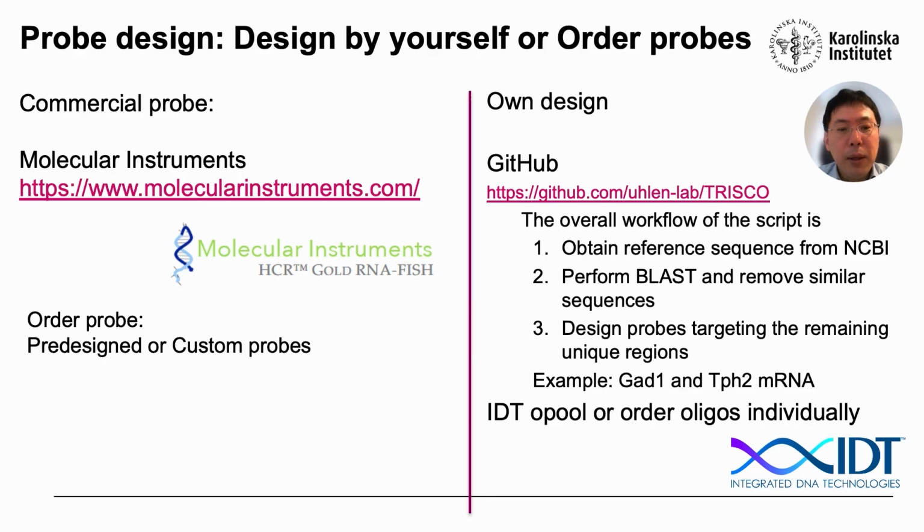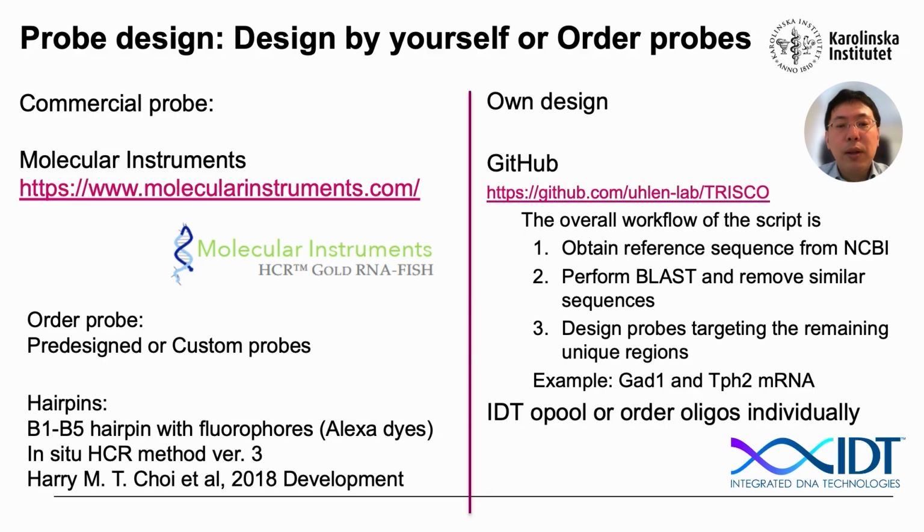Regarding the hairpin, please make sure that the initiator type used in your probes matches the corresponding hairpin type. In our work, we use B1 to B5 hairpins, which are part of the third generation in situ HCR method published in 2018 and are purchased from Molecular Instruments.